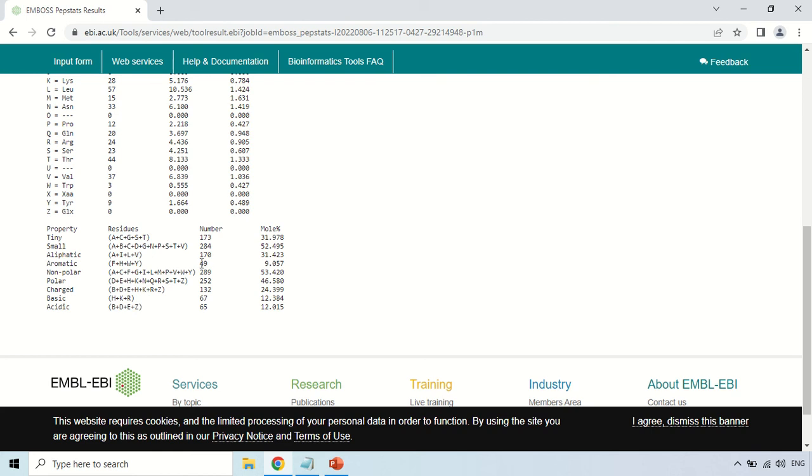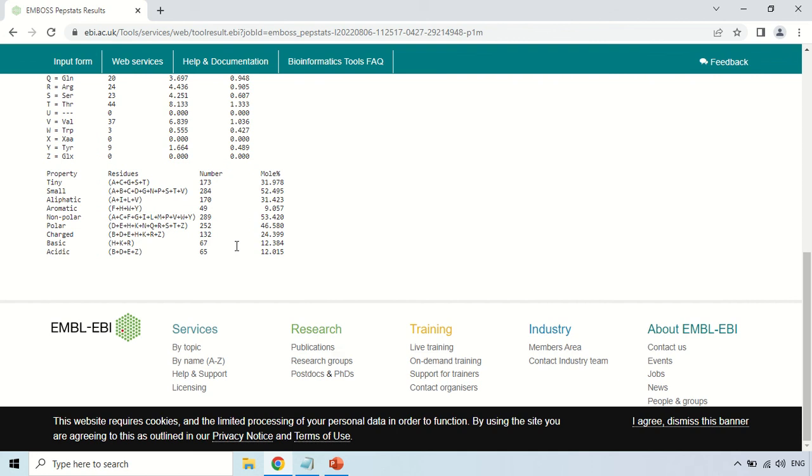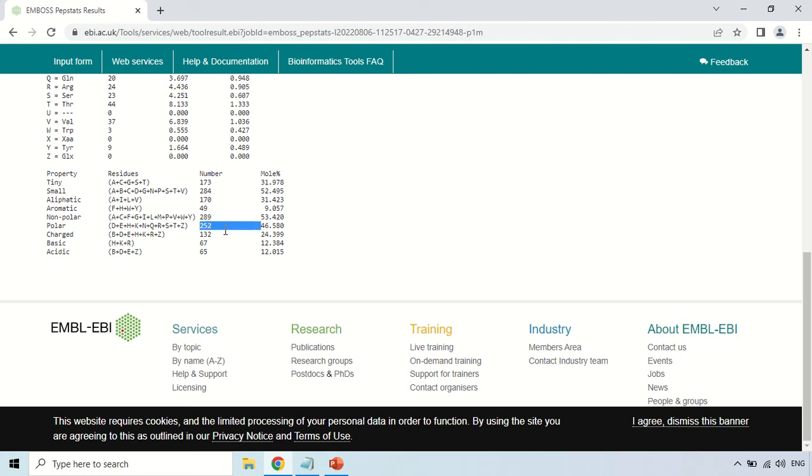Aromatic amino acids, there are 49 aromatic amino acids. You know aromatic amino acids are those like for example phenylalanine, tryptophan, tyrosine. They contain the benzene ring. So there are 49 aromatic amino acids and their molecular percentage is 9.057. About nonpolar, there are 289 nonpolar amino acids. Polar amino acids, there are 252 amino acids which are polar in nature and their molecular percentage is this.